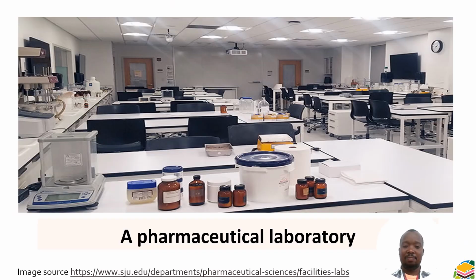So as you can see there, there's a nice diagram of a pharmaceutical laboratory. You see it is spacious, there's a lot of space, a lot of equipment, advanced equipment, and this lab is a formal lab. So indeed a formal lab has its own key characteristics because it is solely designed for experiments to be conducted. So this is a pharmaceutical laboratory.